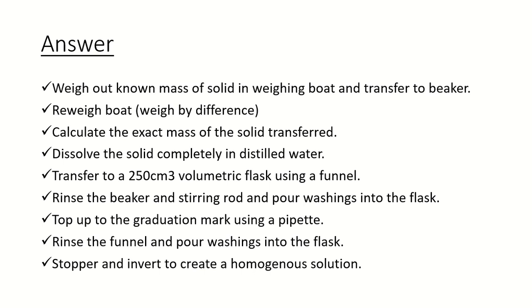Then I'm going to rinse the funnel because again some of the solid might have been left behind on the funnel too because it came into contact with the solution. And again we're going to pour these washings into the flask so that none of the solid is left behind. Finally, to create a homogeneous solution, we're going to stopper the flask so it doesn't spray everywhere. We're going to invert it to make sure it's mixed up and the concentration is the same throughout.